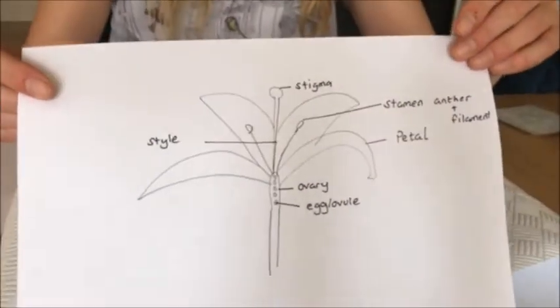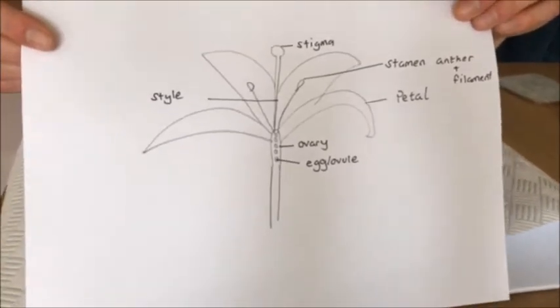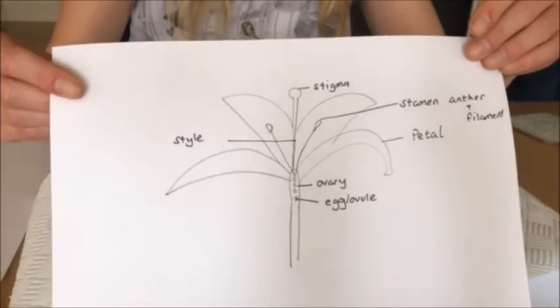Now here is my dissection diagram, and one of the things that you are going to do is to produce your own labelled diagram of an insect pollinated plant.